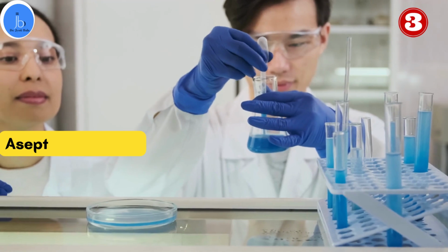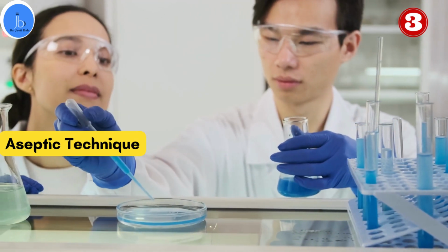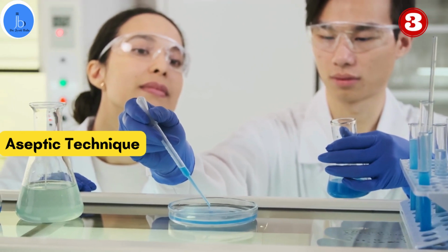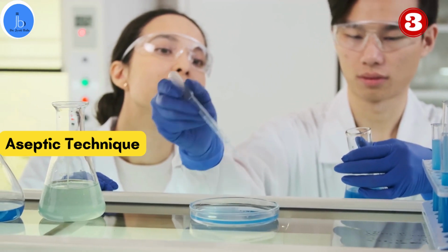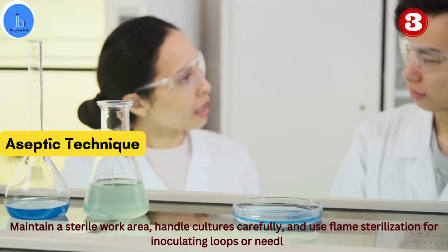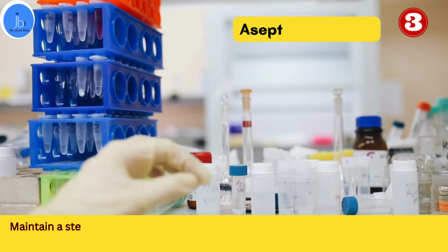The third is aseptic technique. It is a fundamental practice in microbiology. It involves minimizing the introduction of contaminants. Keep your work area sterile, handle cultures carefully, and use flame sterilization for inoculating loops and needles.